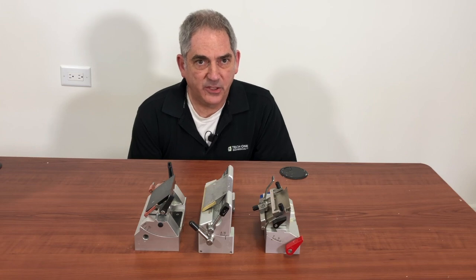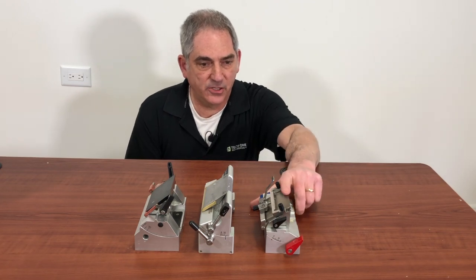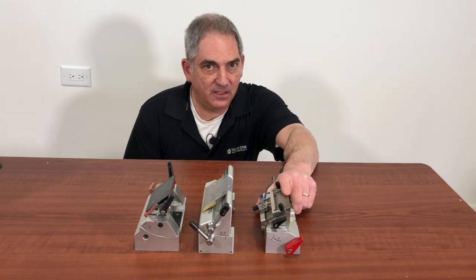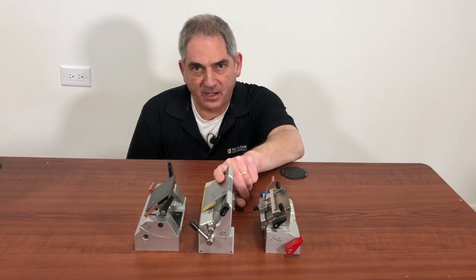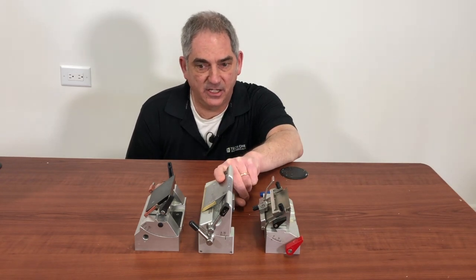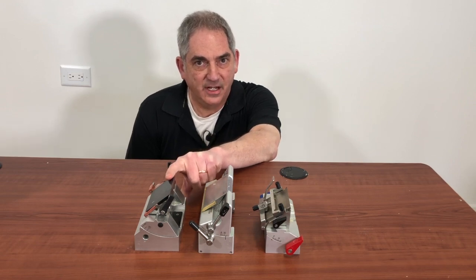Each of the major microtome and cryostat manufacturers use their own angle numbering system. So for example, this is a Thermo Shandon, and the recommended angle on this one is 0 degrees. This is a Thermo Microm, and the recommended angle on this is 10 to 12. And this is a Leica, and the recommended angle on this is 3 to 5.